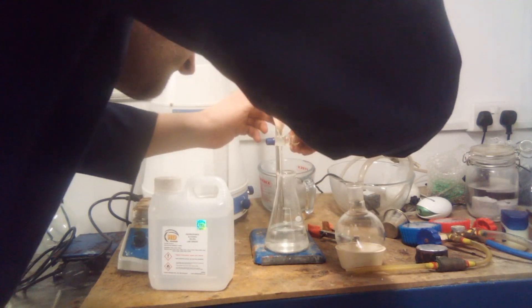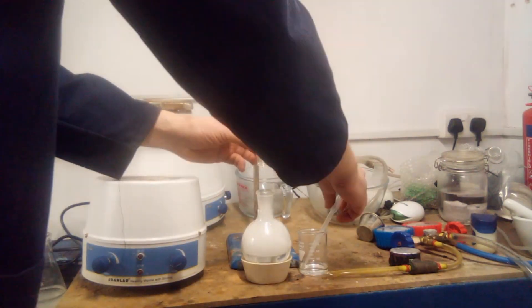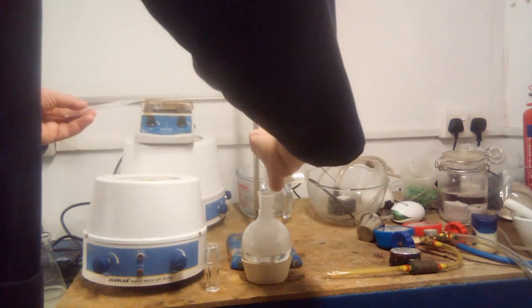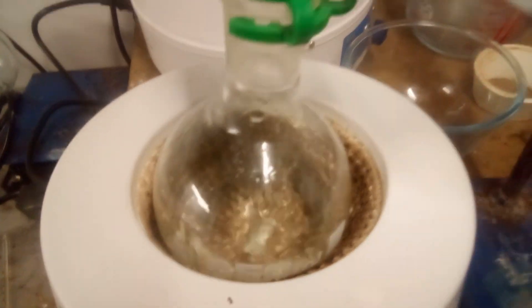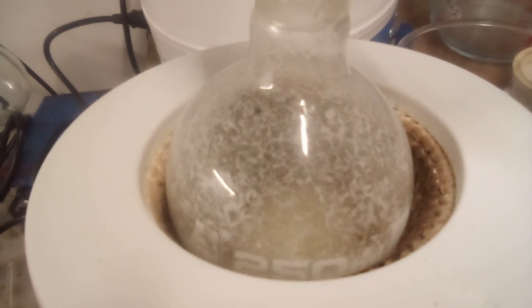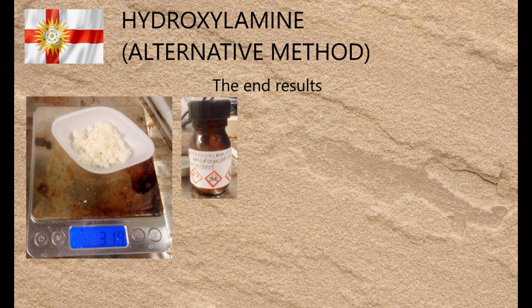In retrospect, maybe potassium carbonate could have worked better. Concentrated hydrochloric acid was added to the alcohol extracts, causing hydroxylamine hydrochloride to form a smoke in the headspace above the liquid. This dissolved with further additions of acid and quite a lot of shaking. Most of the solvent was removed by distillation. Once the alcohol had been removed, the mixture was cooled to ambient temperature, and distillation was continued under vacuum until the product precipitated out as wet solids on the sides of the flask. The product was rinsed out with acetone and a little hydrochloric acid, and dried on the pump to yield a slightly yellow, fluffy, odourless solid with a net weight of 2.1 g, representing a yield of 30% with respect to ammonium chloride.